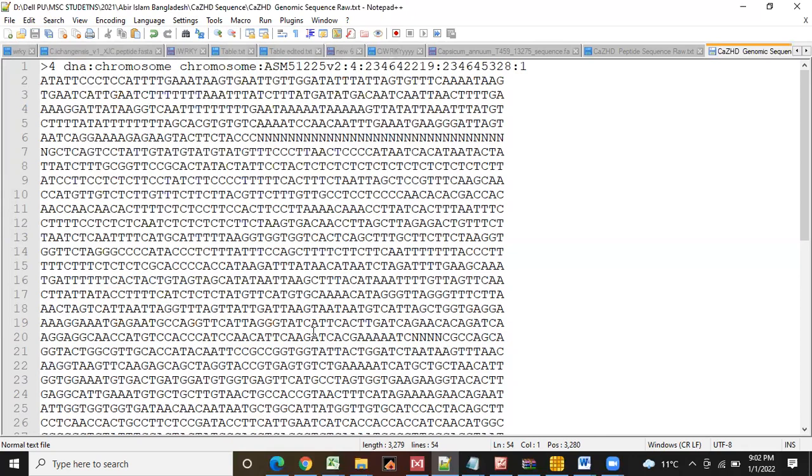This night you will do that. If you completed that, just let me know if I'm awake, then we will go further. Otherwise, in the morning, tomorrow morning, we will proceed further. So you understand what I mean - how to download the sequences.